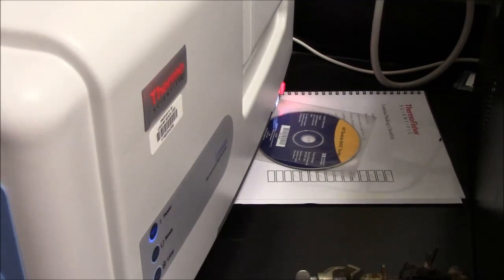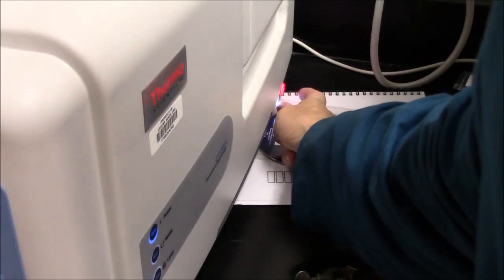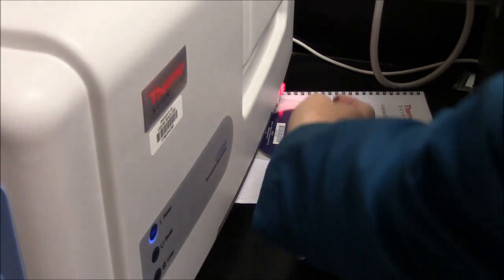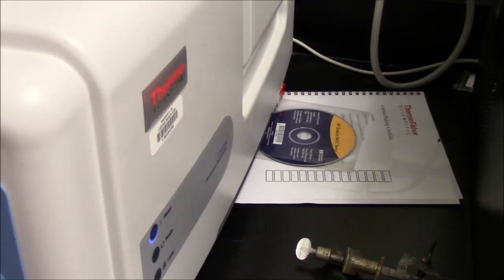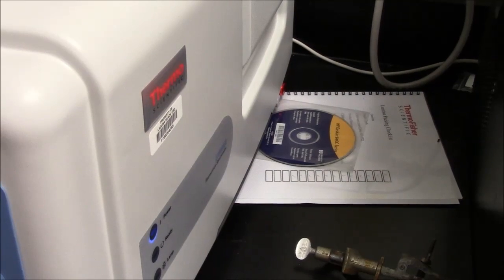If you're shutting down the fluorimeter for the day, the sequence is reversed. So the white is pressed first, and the red follows. The recommendation from the manufacturer is that you do not turn off that last switch, which runs the cooling fan, until 5 or 10 minutes have elapsed. So I'm going to let this run for about 10 minutes, and then I'll turn off the final switch.